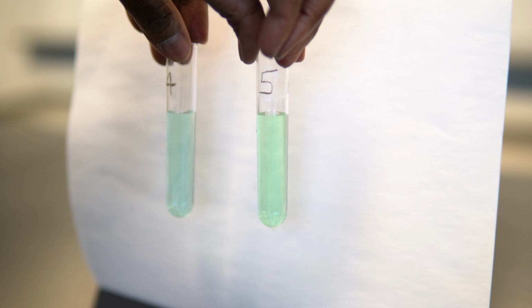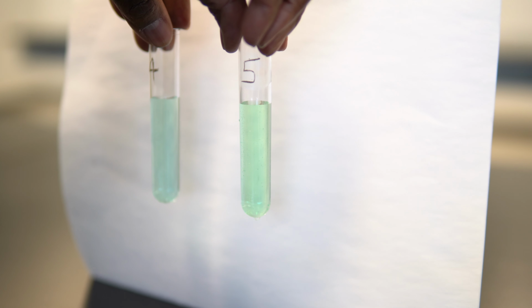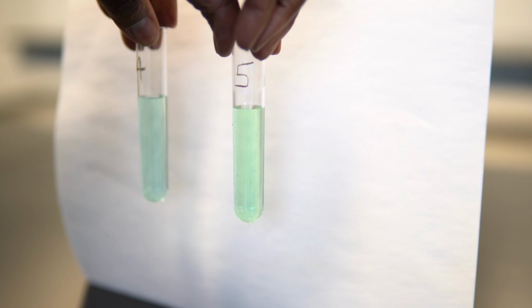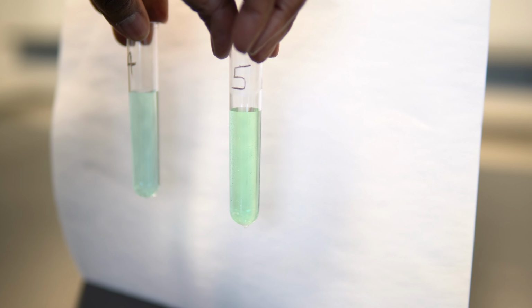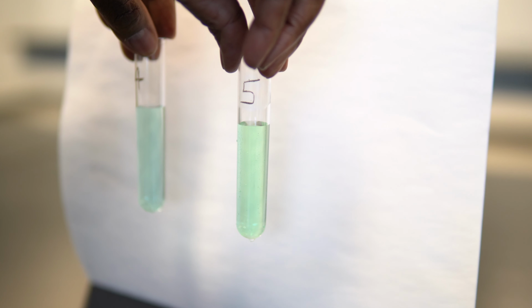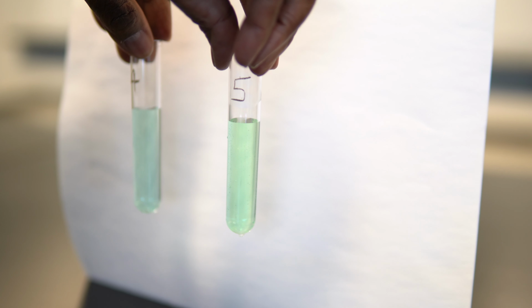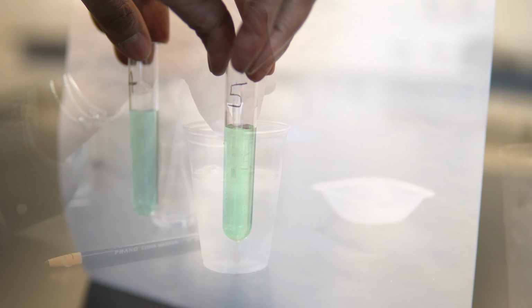Compare the color of the solution in test tube number 5 to the solution in test tube number 4 at room temperature. Take a photo of test tube number 4 and test tube number 5. Record the direction of the equilibrium shift in data table 2 by observing the final color.